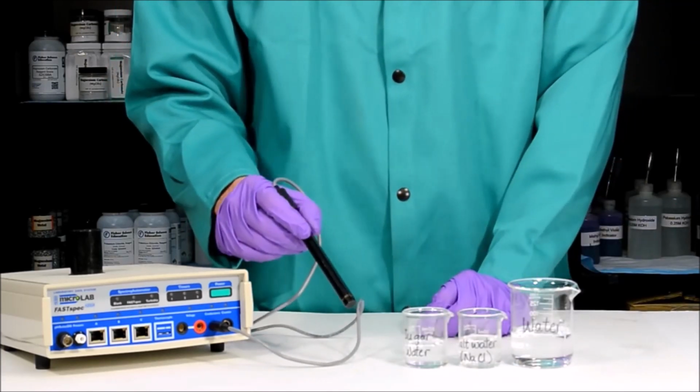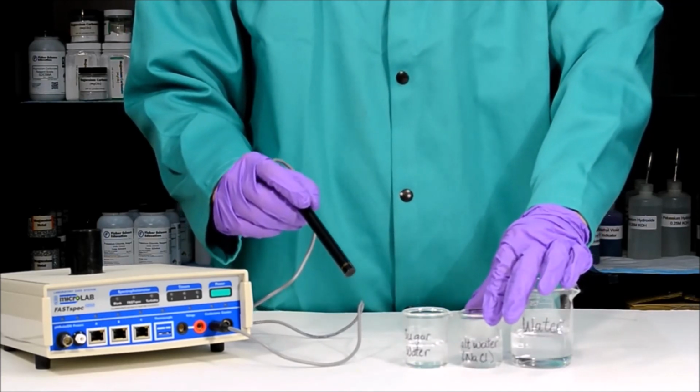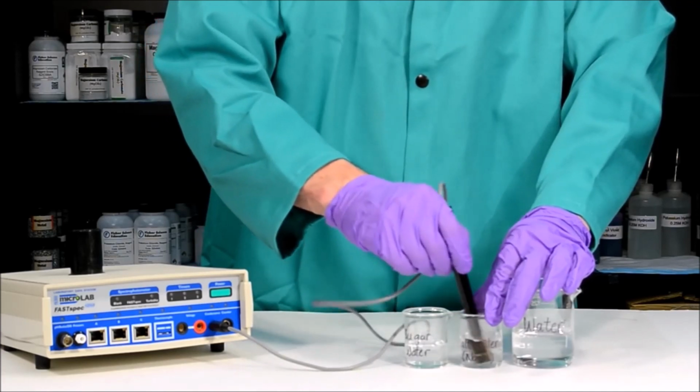In order to measure the conductivity of the solution of interest, you want to have it in a 50 milliliter beaker, which is approximately half full of the solution. Then simply insert the conductivity probe into the solution.